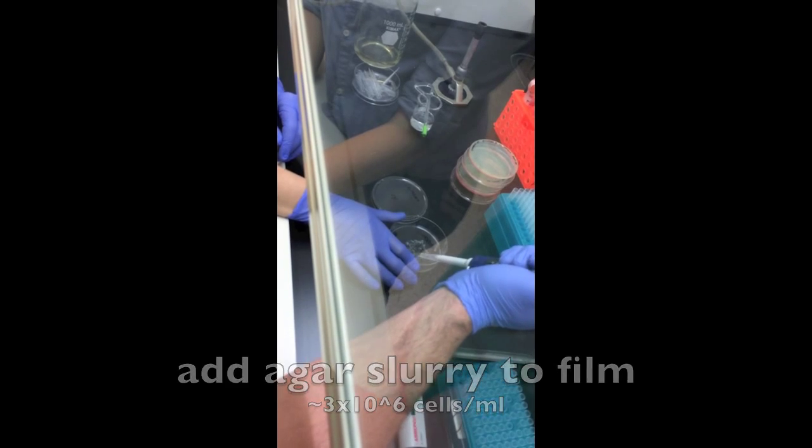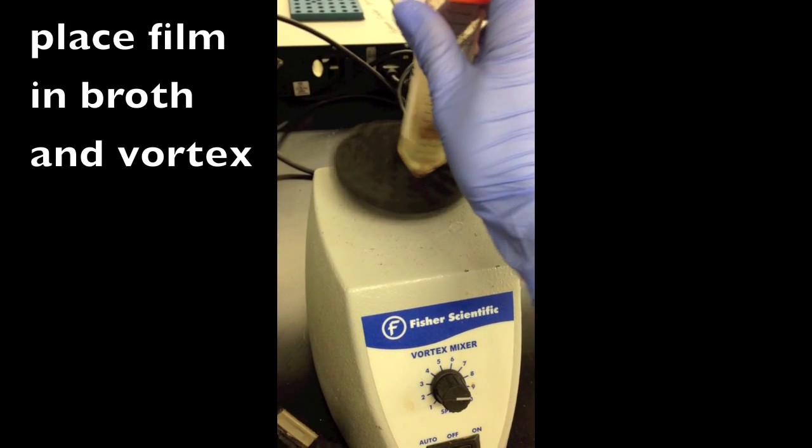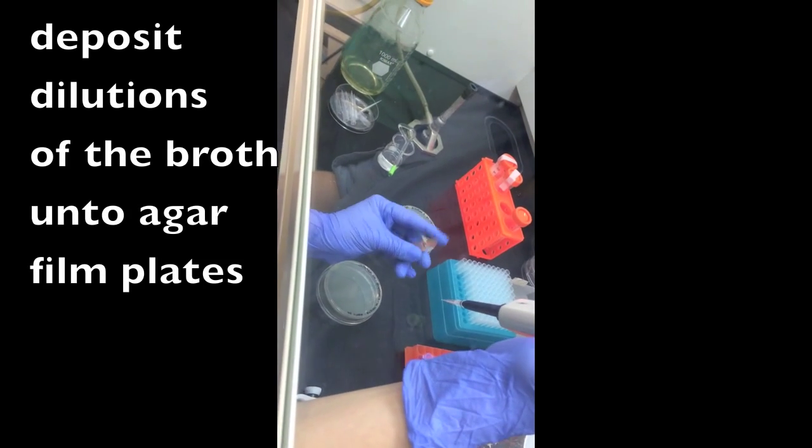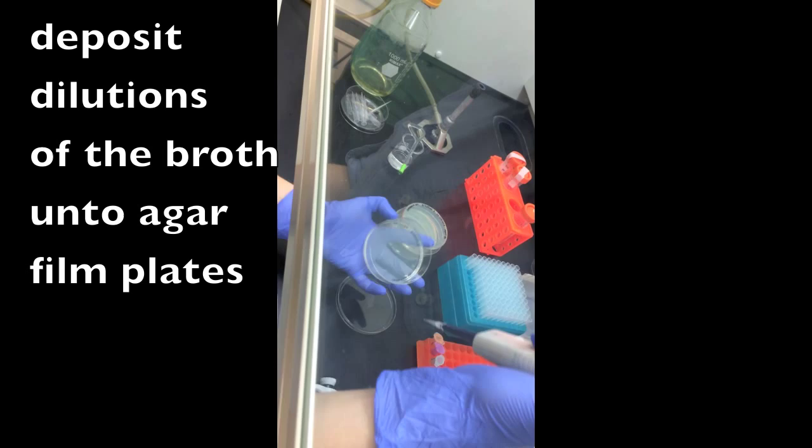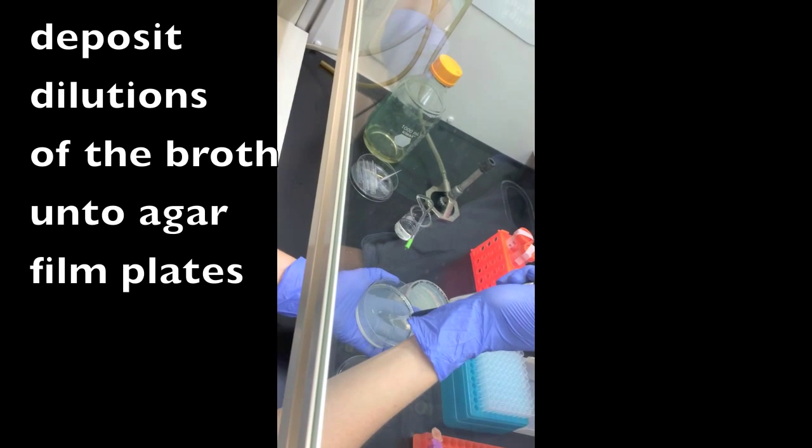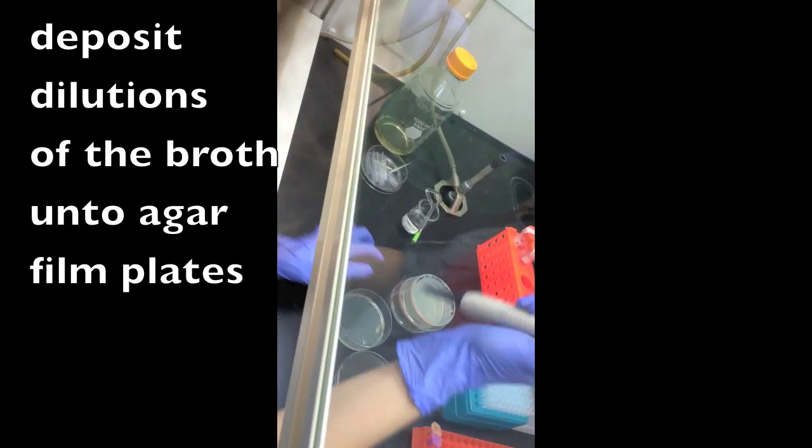Those cut-up films plus the agar with the bacteria were placed in a beef broth, allowing bacteria to cultivate. Then we took different dilutions of this beef broth and placed it onto agar plates, formed as a gel when cooled, which would allow it to grow as cell cultures during incubation.